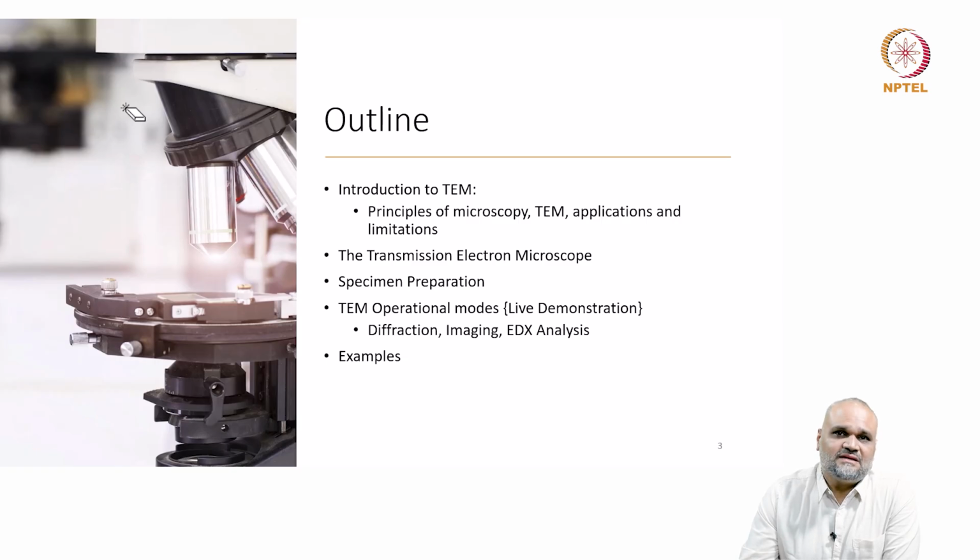I'll start with showing you basic bright field imaging, dark field imaging, diffraction, and high resolution imaging, and how do we analyze and interpret the data that you get. I'll also focus on various specimen preparation techniques, from the conventional classical techniques of cutting, grinding, polishing, and electropolishing and ion milling, to modern techniques such as focused ion beam and SEM, where you're preparing specimens from a particular location.